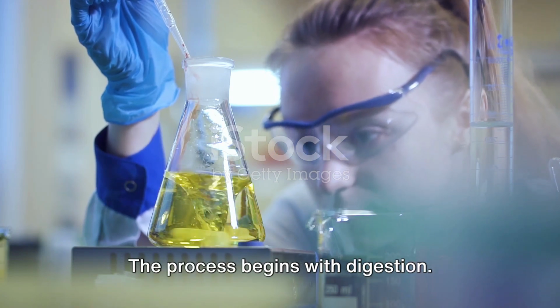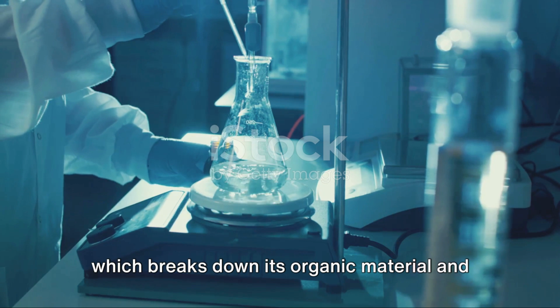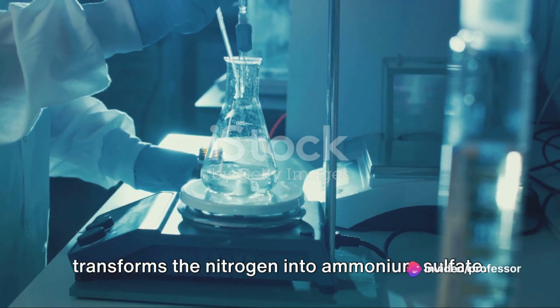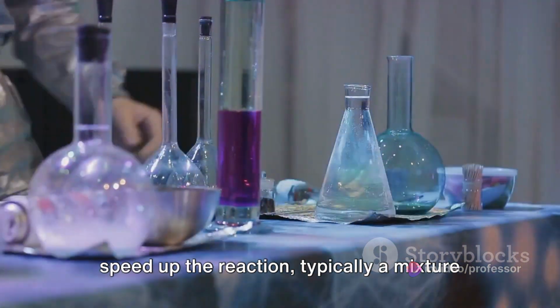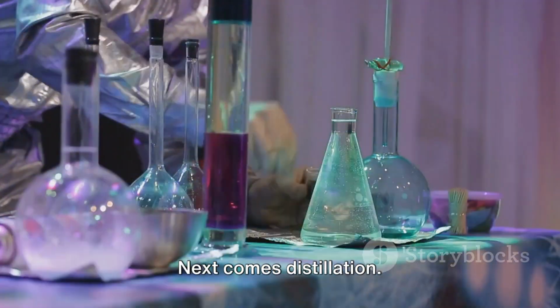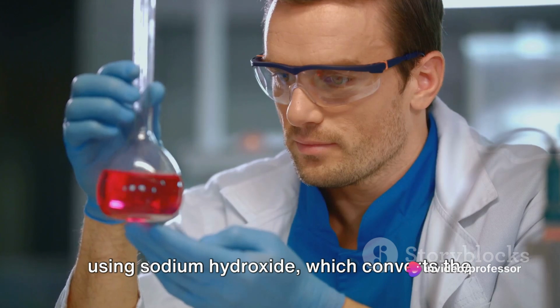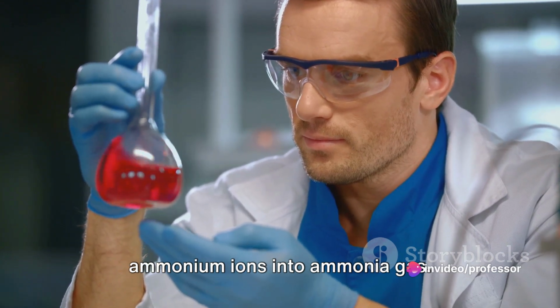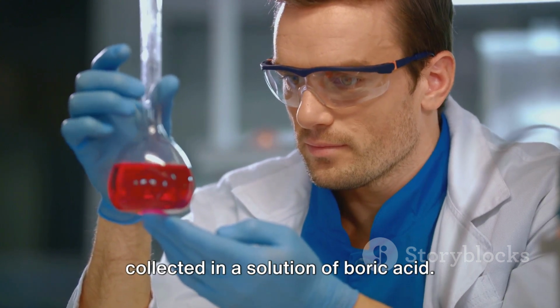The process begins with digestion. The sample is heated with sulfuric acid, which breaks down its organic material and transforms the nitrogen into ammonium sulfate. This step also requires a catalyst to speed up the reaction, typically a mixture of potassium sulfate and copper sulfate. Next comes distillation. The digested sample is made alkaline using sodium hydroxide, which converts the ammonium ions into ammonia gas. This gas is then distilled off and collected in a solution of boric acid.